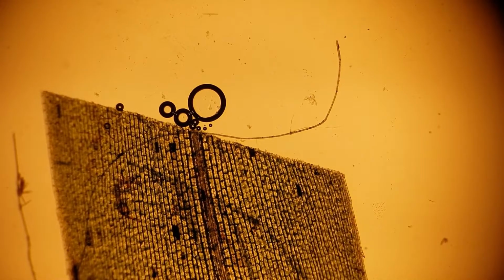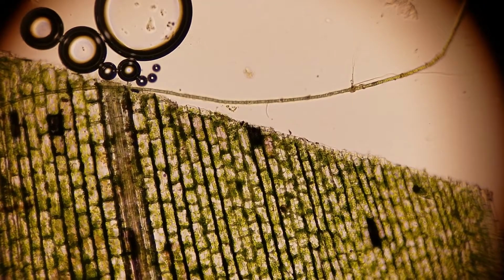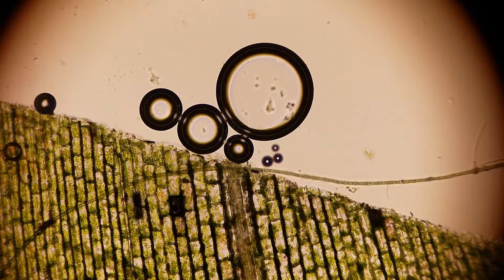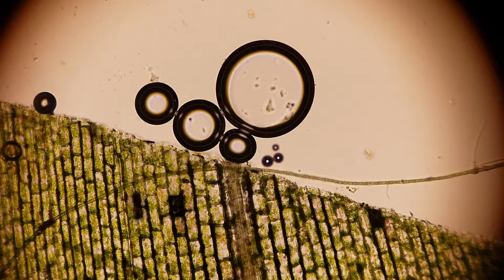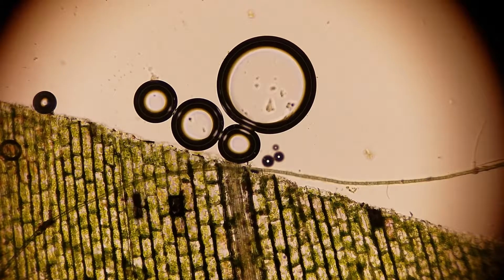Let's take a look at those air bubbles. I see something interesting. Now at 10 times objective. What's going on with these air bubbles? It almost looks like small air bubbles are coming out of the stem of the plant. Isn't that weird?